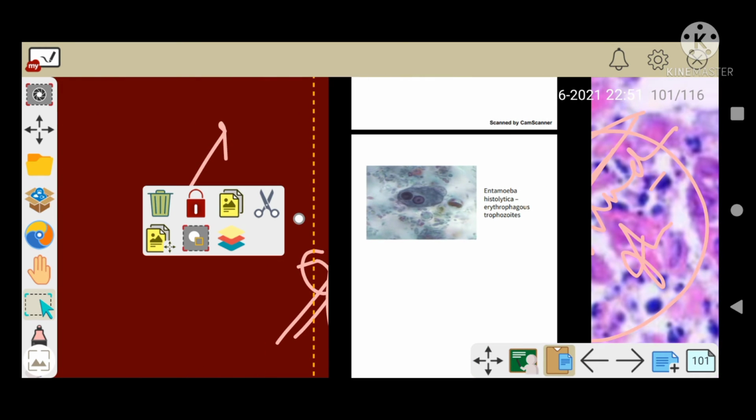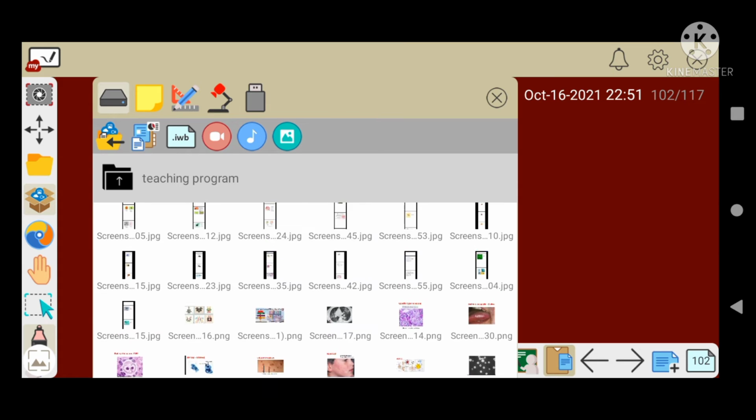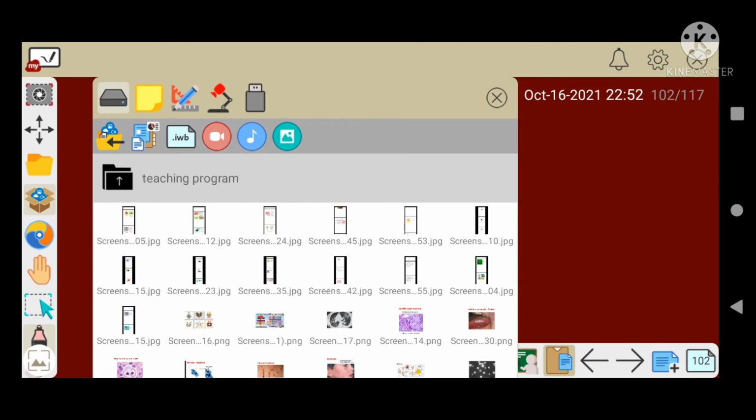Okay, so what is this? Correct. So this one is your Entamoeba histolytica, right? Entamoeba histolytica we discussed in our previous session. So just look at the image, correct? You have to bring the theory and collaborate it with the images. Then your perception about the subject will be clear. You can answer wherever they ask, right? No issue.